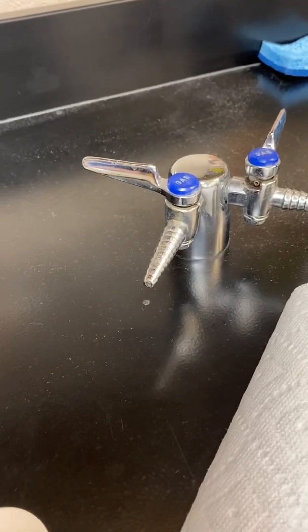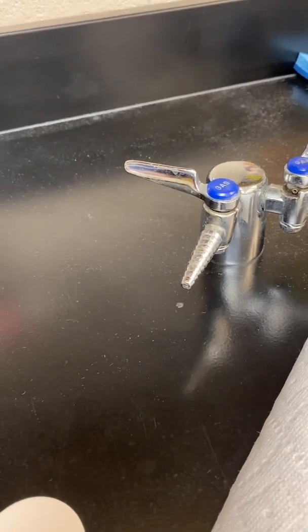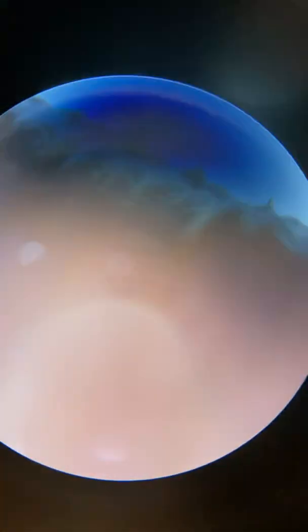Oh, he already moved out of the field of view. Oh, you can briefly see the little hair-like structures. Do you see those? Those are the setae.